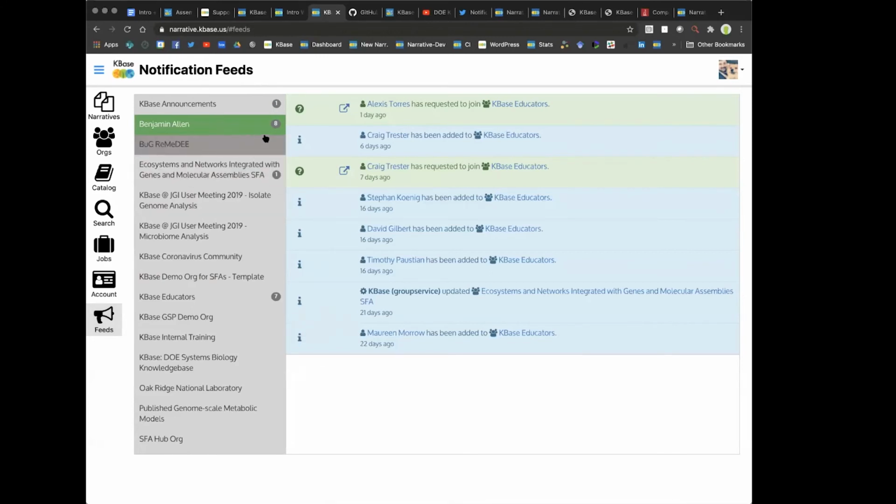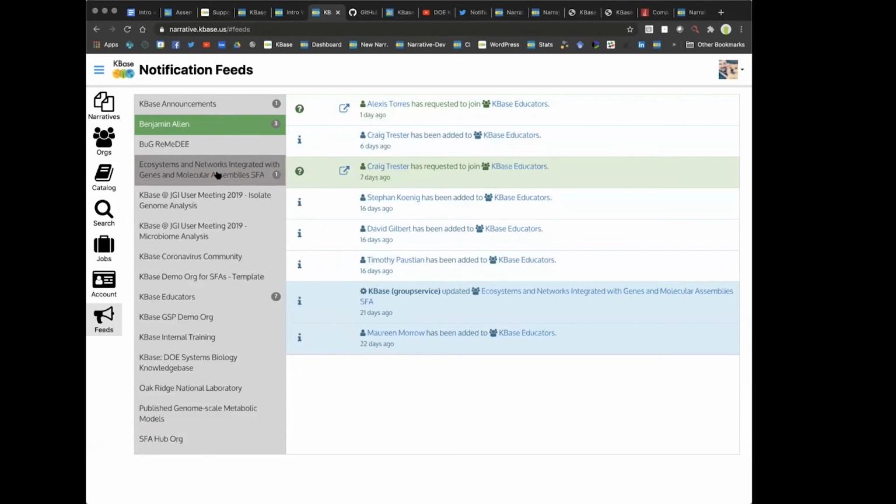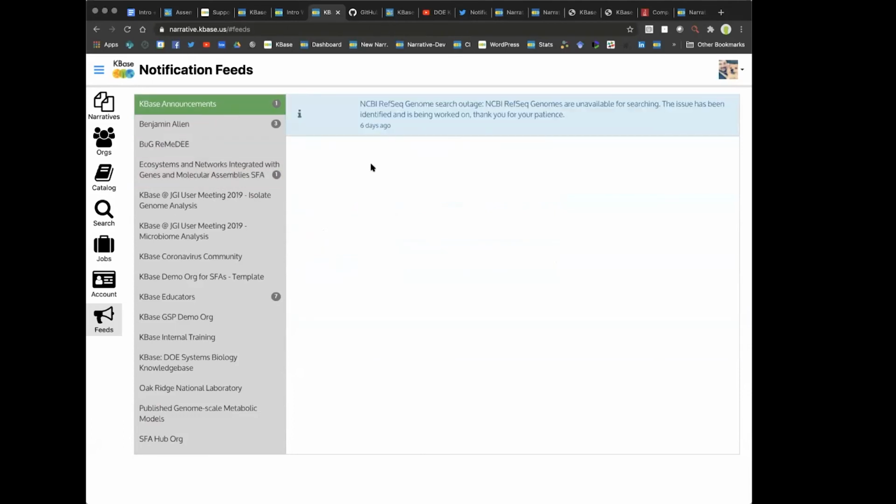For instance, you can see here, I've got 8 notifications to my account and it's mostly people looking to join this educators group. I think they have all been added, so I will mark as seen, and that clears the notification. So feeds basically just gives you some indication of what's happening in your orgs. That's the primary function of it right now, and you can also see information about system outages and stuff like that. So as you can see, the RefSeq public genome database is being worked on right now.